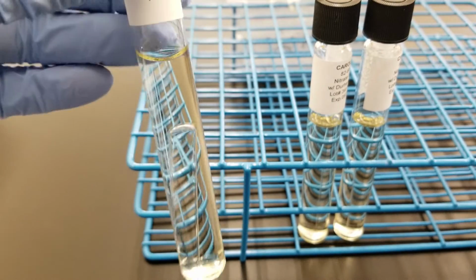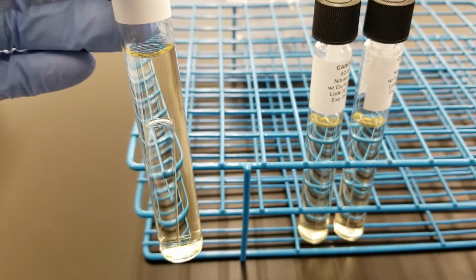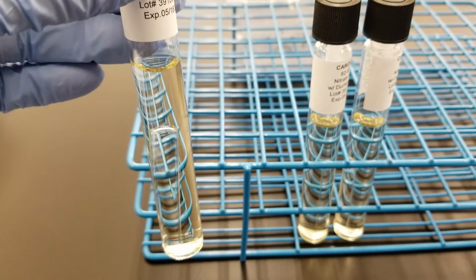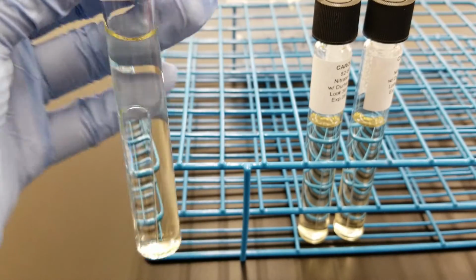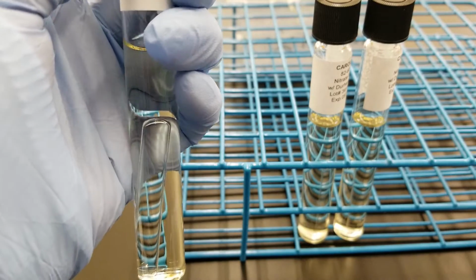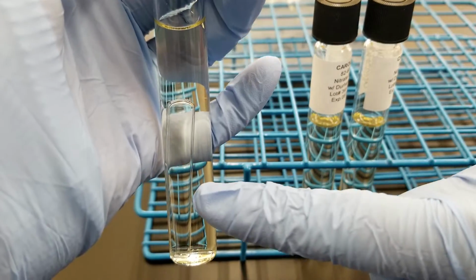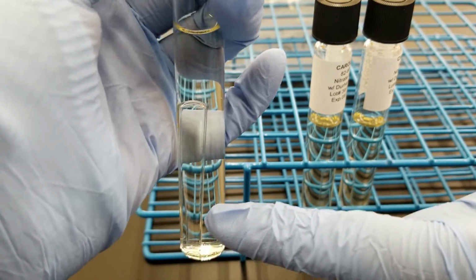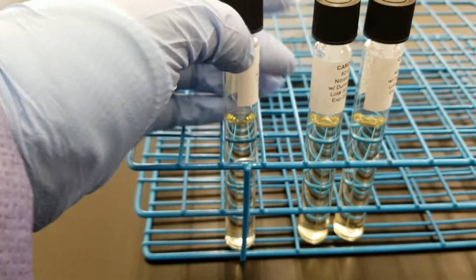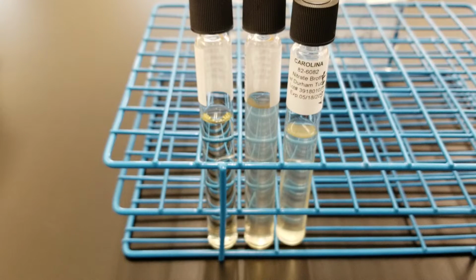This one is your control tube. This is uninoculated. It's going to be incubated and tested with the reagents just the way that you would test the test organisms to make sure that the process is going correctly, including that there is no contamination of this tube itself. Okay, so non-CO2 incubator for 24 or 48 hours, and I'll get back to you.